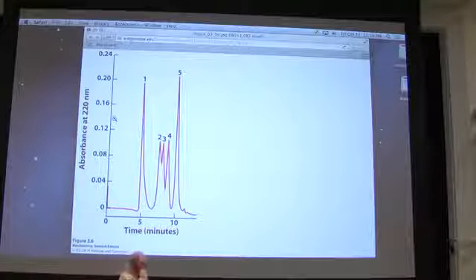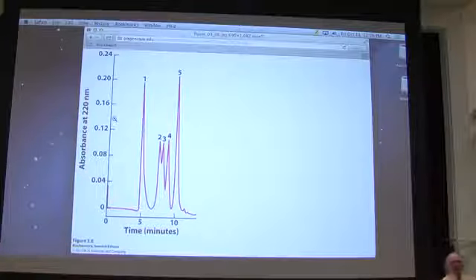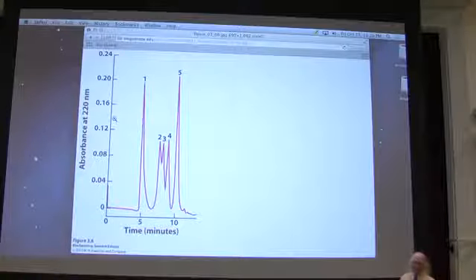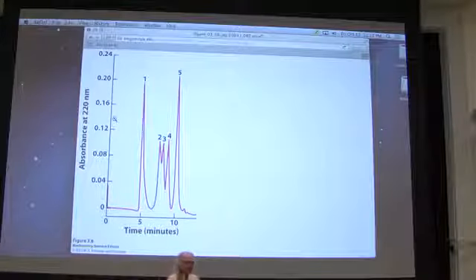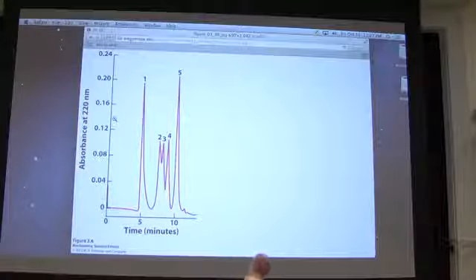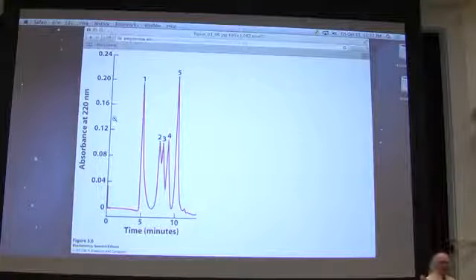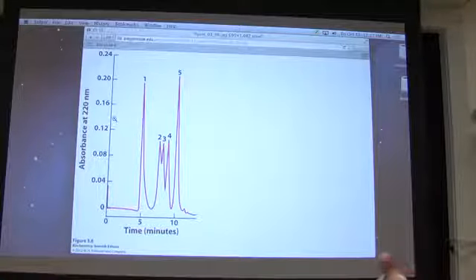All right? Now, there are two main types of HPLC. Actually, one I'm going to talk about, but there are two that exist. They're called reverse phase and normal phase. Reverse phase is by far the most common one used, and that's what I'm going to talk about here. Reverse phase chromatography uses these tiny beads that have very nonpolar molecules attached to them. We can think of long carbon chains sticking off of those beads. Nonpolar molecules are on the surface of those beads.